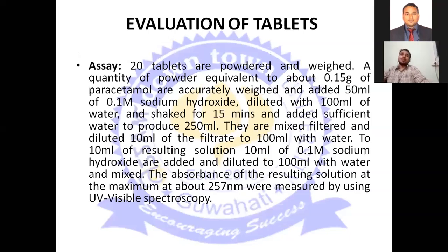Next is the assay of the tablet. For the assay, 20 tablets are powdered and a quantity of powder equivalent to about 0.15 g of paracetamol is accurately weighed and added to 50 ml of 0.1 molar sodium hydroxide, diluted with 100 ml of water and shaken for 15 minutes. We take a 250 ml round-bottom flask, add the powdered tablet and add 100 ml of sodium hydroxide solution.